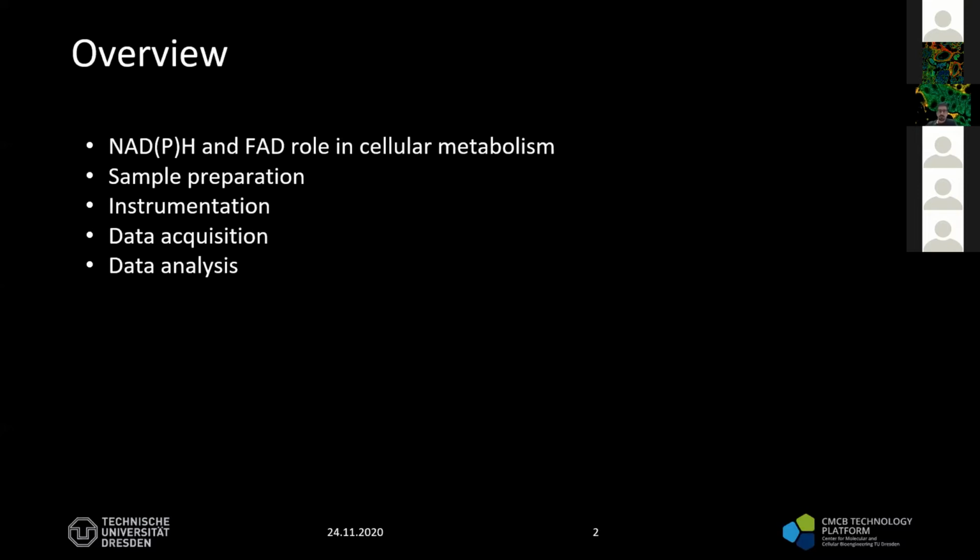Then we talk about the instrumentation and review some parameters which are left from the other workshops. Not so many left, we'll see. How to properly acquire FLIM data, and later on how to analyze them. So the analysis today will be mainly focused on the reconvolution and fitting of the decay curves.